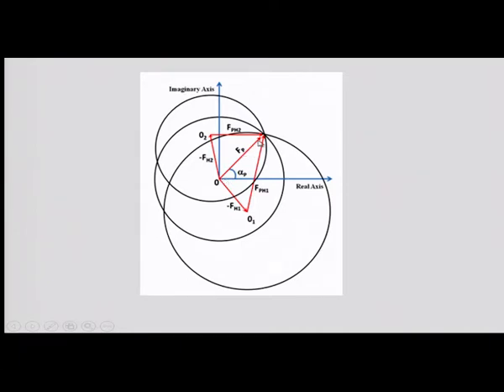Now, when you have the first derivative, the contribution of the derivative goes this way, so it is minus F_H1, and adding this to F_P you get F_PH1. So, with the origin shifted to O1 prime and with radius mod F_PH1, I draw a circle. This is this circle.